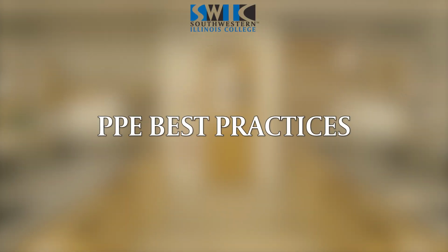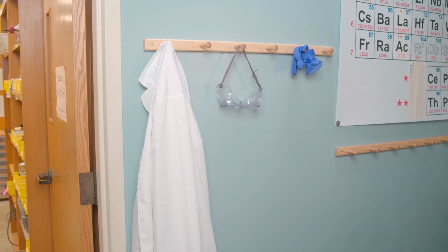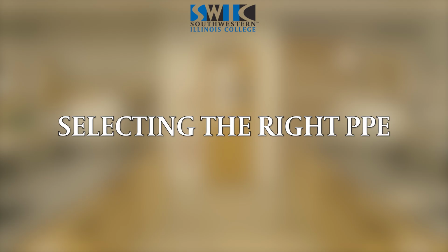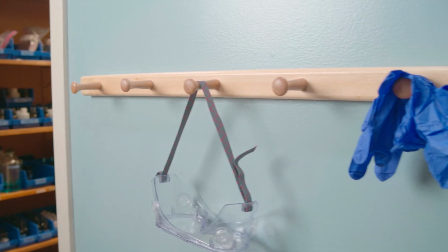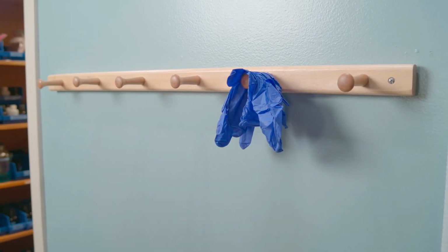Personal protective equipment, or PPE, is your shield in the lab. It protects you from potential hazards, ensuring you can work with confidence and peace of mind. Always choose the appropriate PPE for the task. This might include lab coats, gloves, goggles, or masks. Using the right gear is your first line of defense.